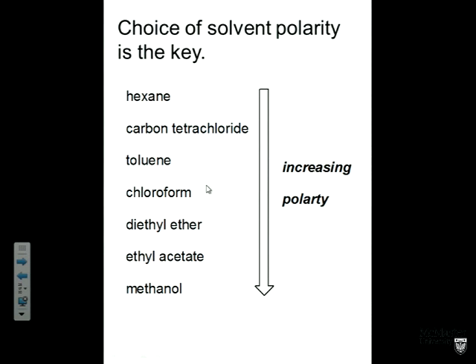Why is it actually called chromatography? Chromatography comes from the Greek chromos, meaning color. And in fact, it originated as the separation of colored compounds. So that's what we were just saying, that you could use your eye as a detector to see the different bands coming down the column.